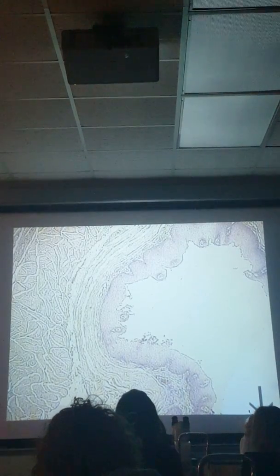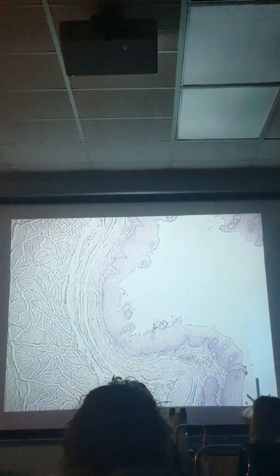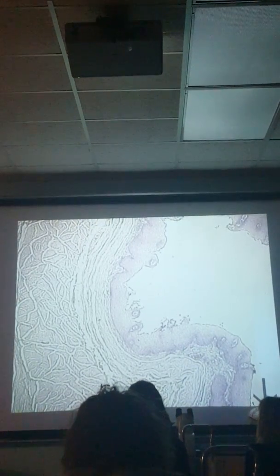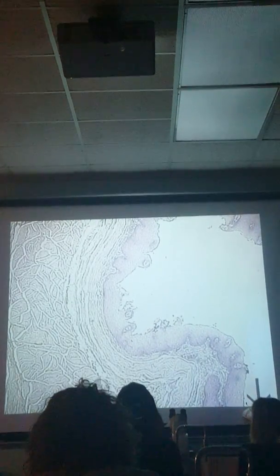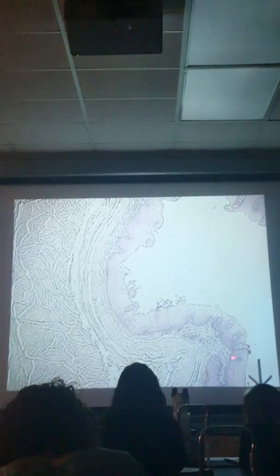So we can see those layers. So we have the epithelium or the mucosa layer through here, and this is again stratified squamous. You see multiple layers, nice layers.